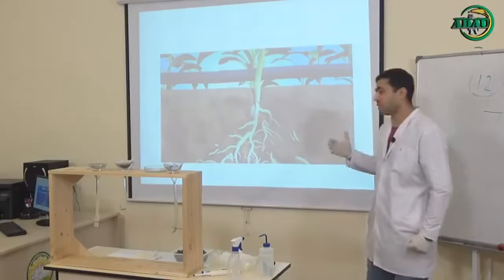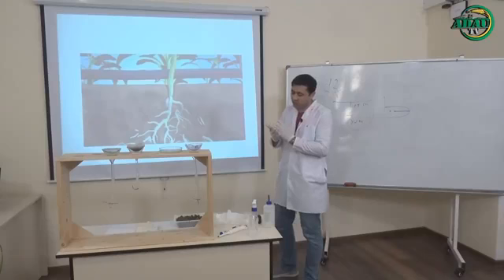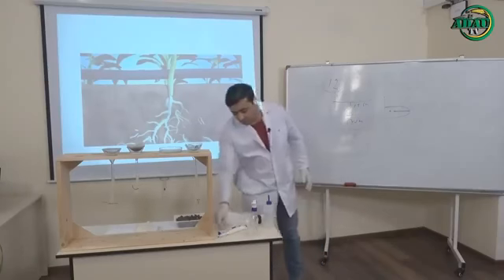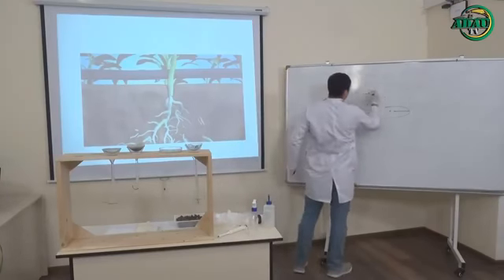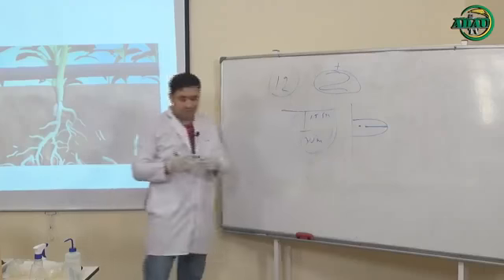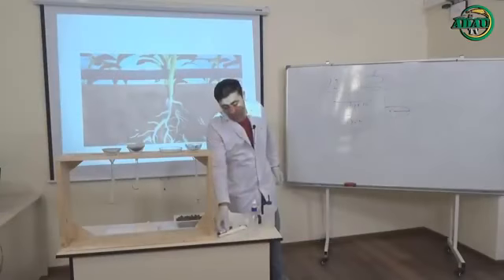Also, sometimes if you cut all parts of the roots, under the microscope we can see nematode eggs. You have to take care about this point. If you can see this kind of eggs inside the roots, it means your plants are already infected. That means you have a problem in your plants, in your fields.